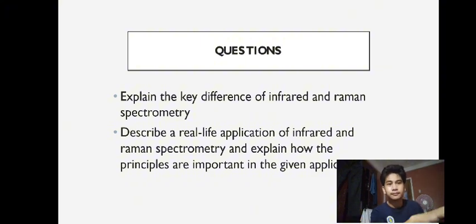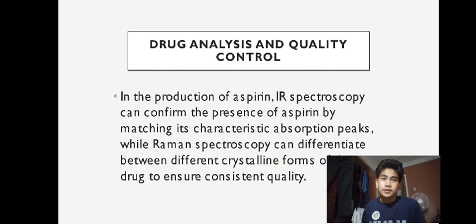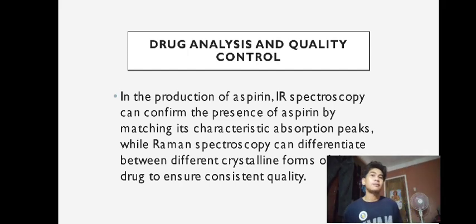Okay, thank you. I will discuss the real-life applications of both infrared and Raman spectrometry. We can apply them in drug analysis and quality control.